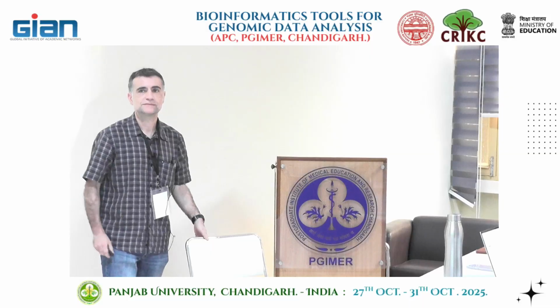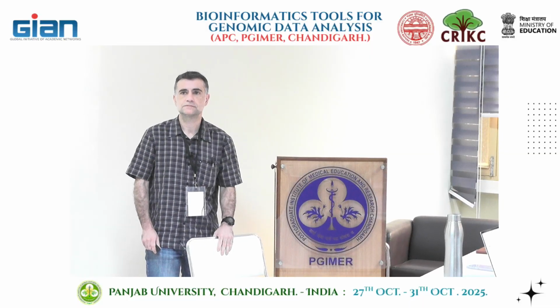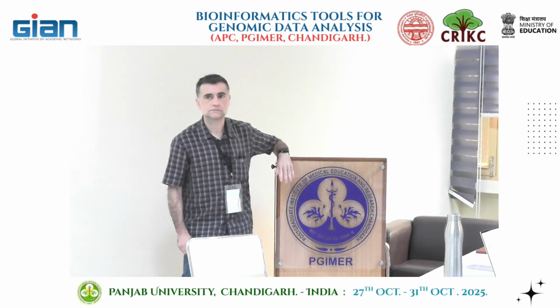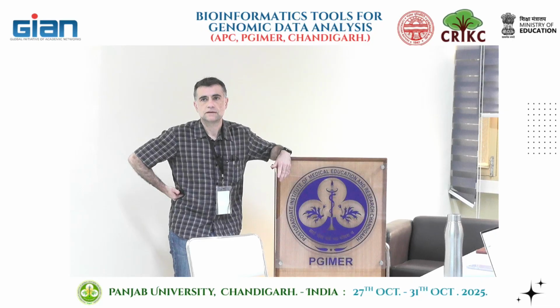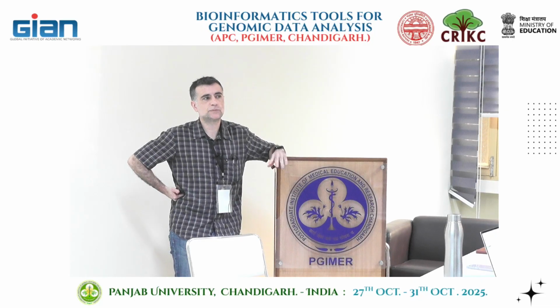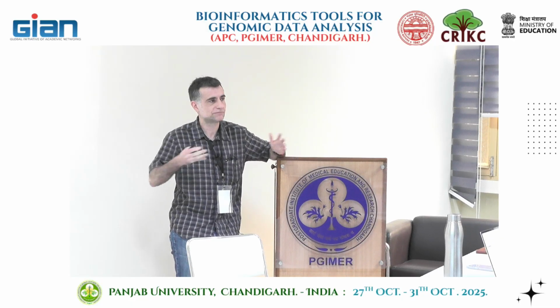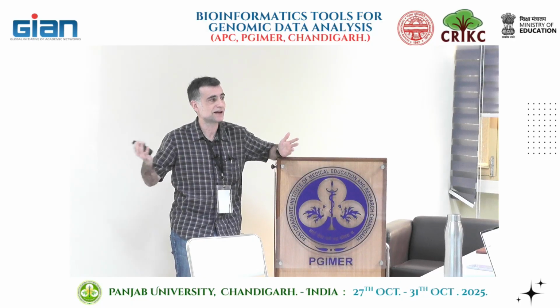So I just wanted to make one point. The same set of commands work the same way. You can use this in RStudio. If you are running RStudio and that is what you are comfortable with, just use that. Jupyter Notebook is not a language, it's what we call an IDE. RStudio is an IDE, Jupyter Notebook is an IDE. R is the language, so whatever you're typing is just R. You can use it in any IDE.